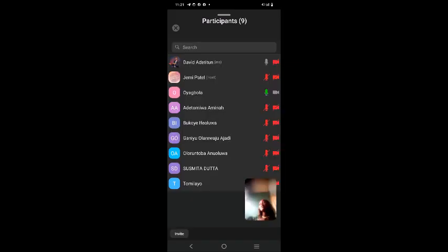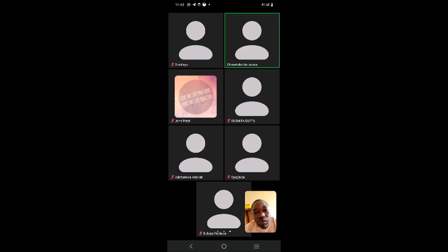Then there are some things that need to be considered while we are applying these sterilization methods, because they are used based on the type of materials that we want to sterilize. Without consideration of materials, there may be error in the application of these sterilants. So there are some considerations and best practices that need to be taken into account.